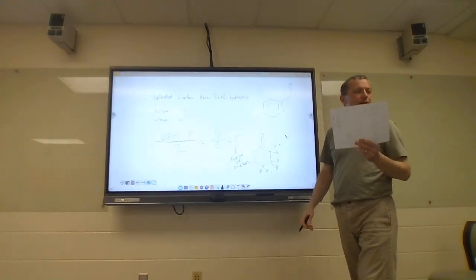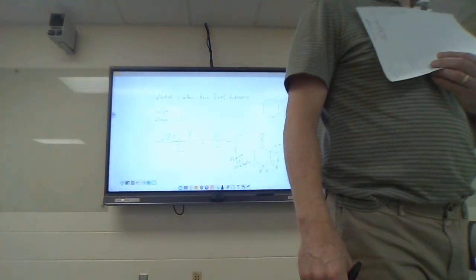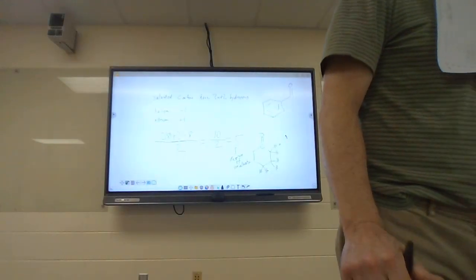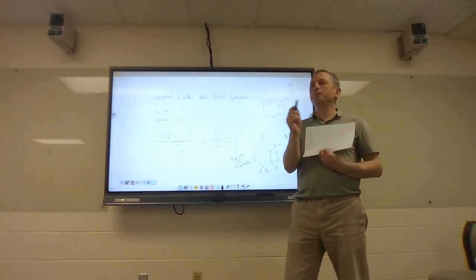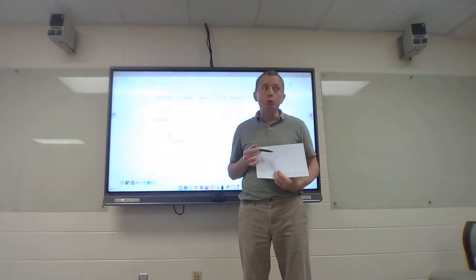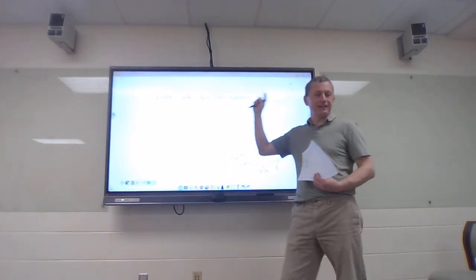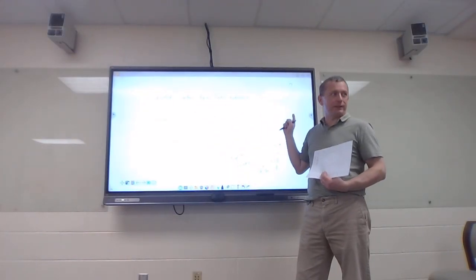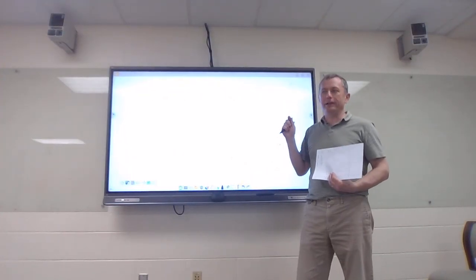Now looking at the NMR. Instead of doing all that, you do not have to do degrees of unsaturation. The biggest thing I would say is when you see way too few hydrogens, clue into maybe I've got some double bonds and rings. And when it's really low, it's probably aromatic.